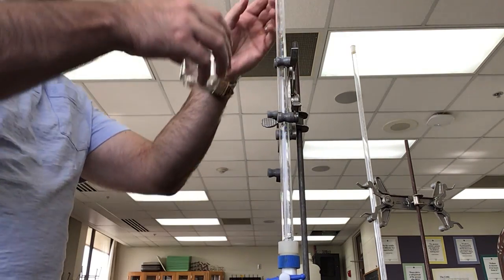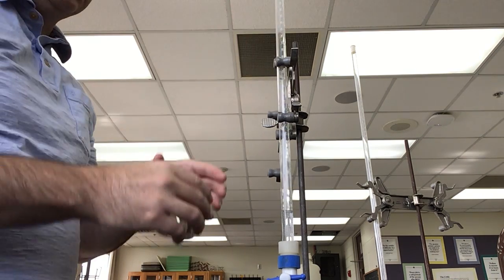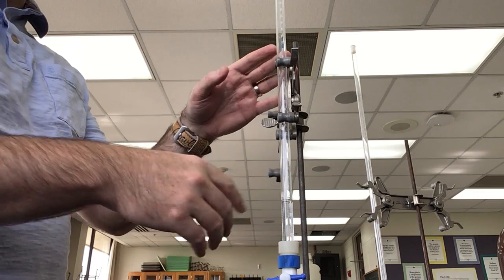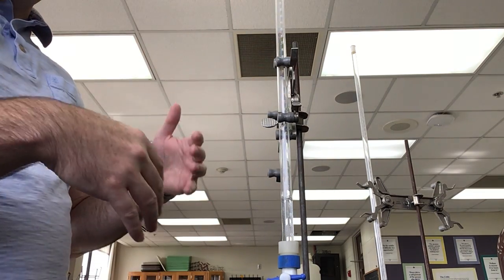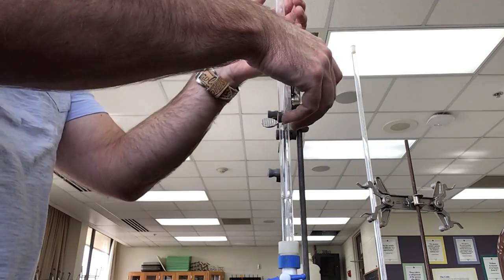Oftentimes when you get a Buret, you don't know who used it beforehand. And if you were in a previous class period and they had rinsed this out with water, if you just add your titrant into your Buret and start titrating, because of the little bit of water that's in here, your titrant will now become more dilute than it actually is, which will throw off your data.